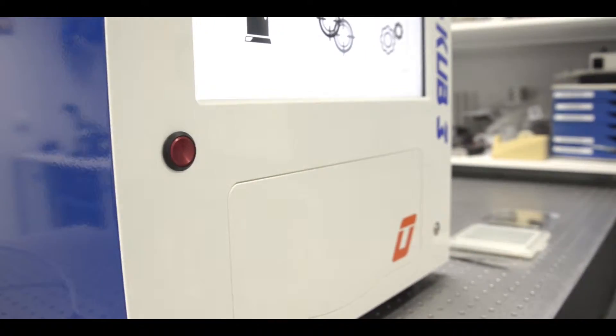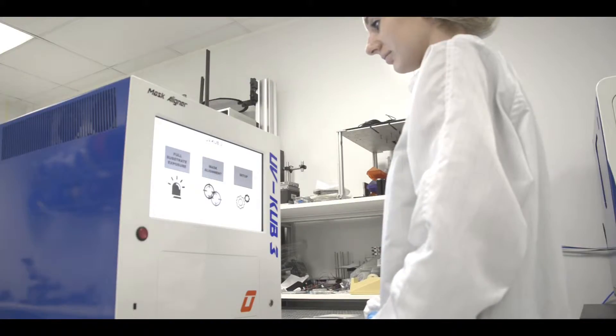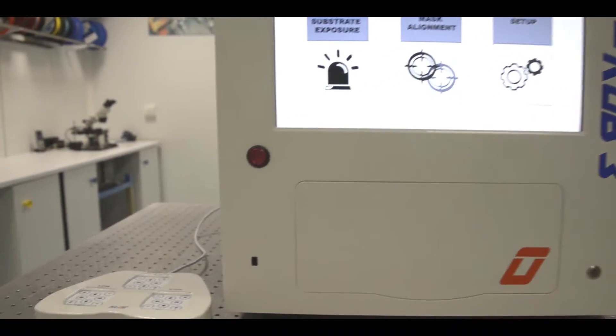Boasting the latest technology, UV-Cube 3 allows the alignment of 5-inch masks with a 4-inch wafer or less, for a 48-centimeter machine footprint.